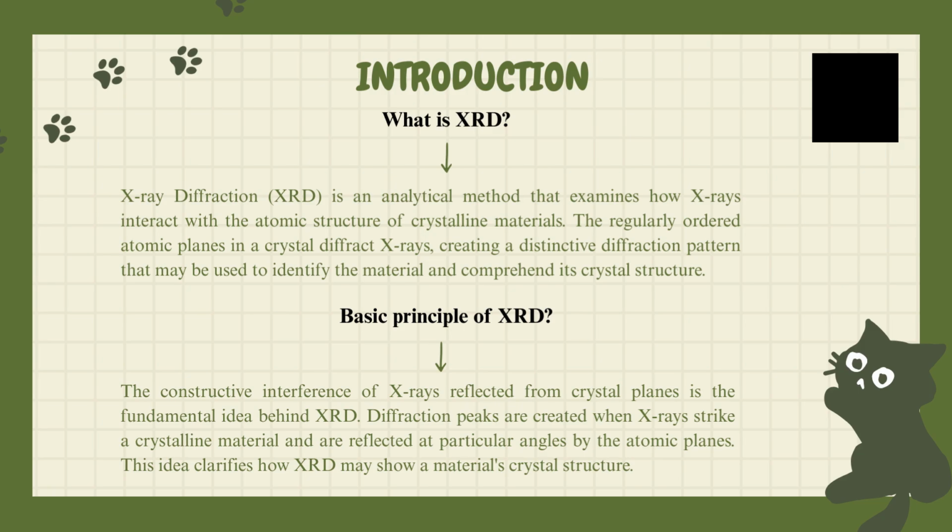XRD stands for X-ray diffraction. It is an analytical technique used to study crystalline materials. When X-rays hit a material, they interact with the crystal structure and produce a diffraction pattern. This pattern helps identify the material and understand its crystal structure.